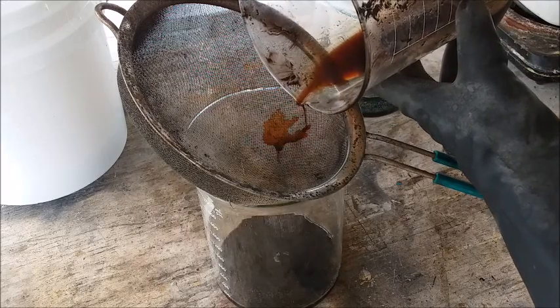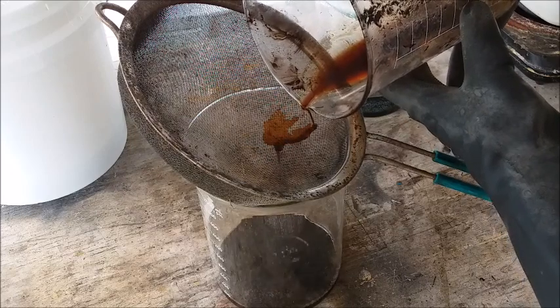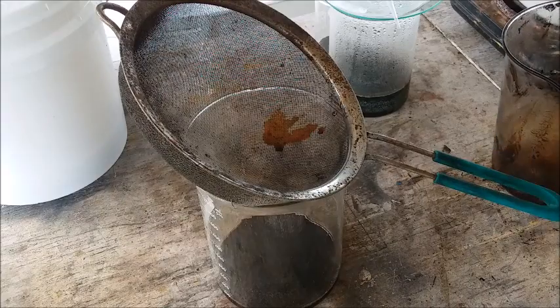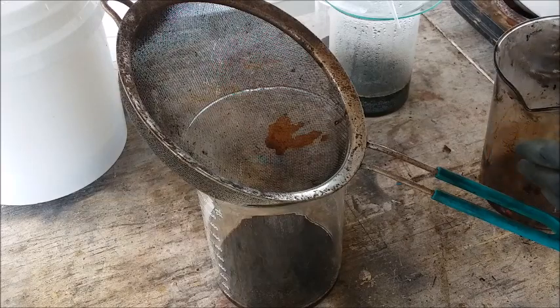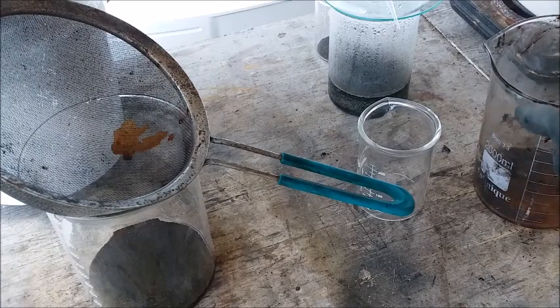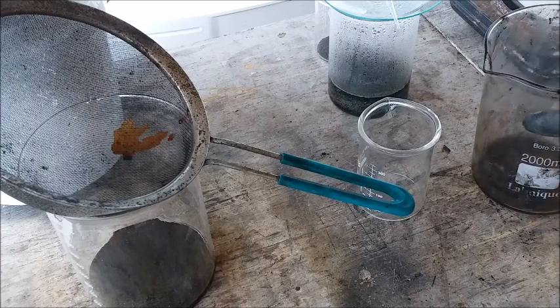Another reason I don't really like this wet ashing process. Separating the gold from the acid is not easy. There, I don't really think I want to pour off anymore. I'm afraid I'm going to wind up with a lot of gold in the acid there that I'm pouring off. What I think I'm going to do is switch back to this smaller beaker. Get my spray bottle. Ooh, yeah, sizzle. And remember, that's acid in there. Adding water to acid is dangerous. Sizzle, pop, and steam, yep.